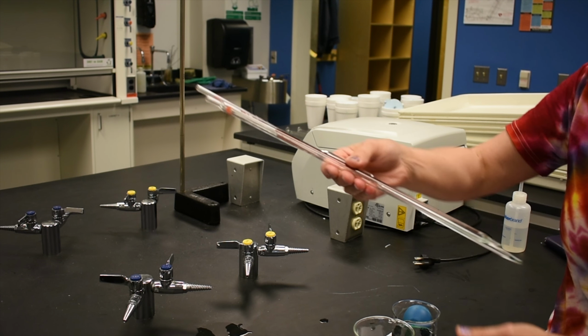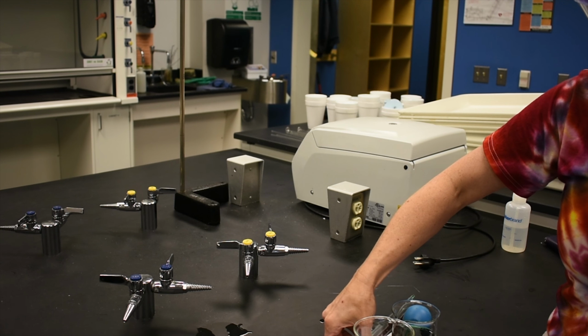So the first thing, when you're using pipettes, make sure that they are placed on your lab bench in such a way that they will not roll off the bench and break. So I have these set up so that they are behind the beakers and they won't roll off.